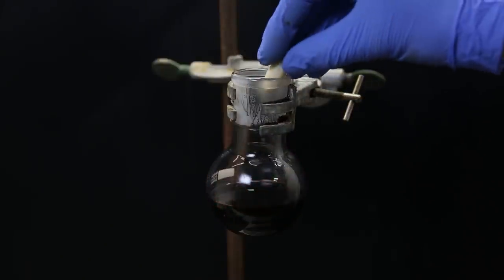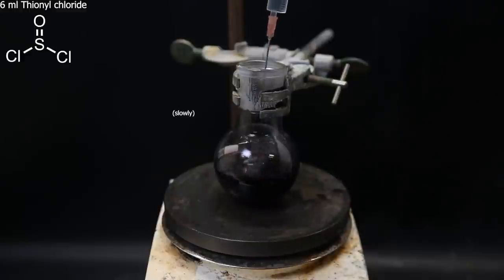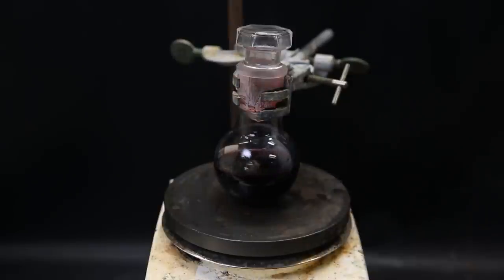I then add a stir bar, and move the flask to a stir plate. Now I add 6 ml of thionyl chloride, and stopper the flask lightly, to allow any gases to escape. I then leave it to stir for an hour.